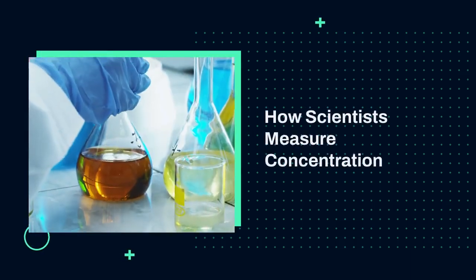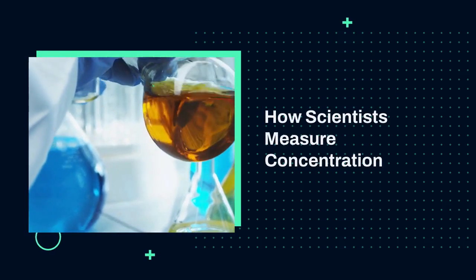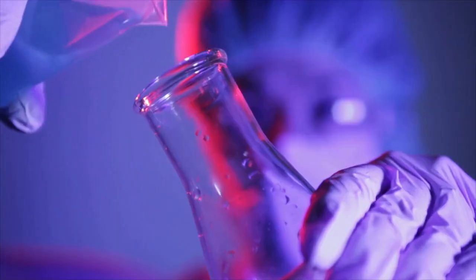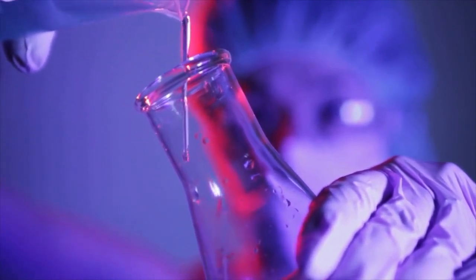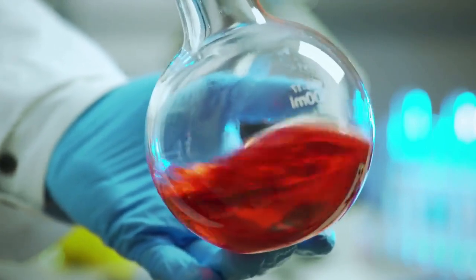Hello everyone! Ever wondered how scientists measure the concentration of a substance in a clear solution? One of the most common ways is using a technique called UV-Vis spectroscopy. Today, we're going to break down exactly how you can calculate concentration from the data you get from a spectrophotometer. It all comes down to a simple but powerful rule called the Beer-Lambert Law.